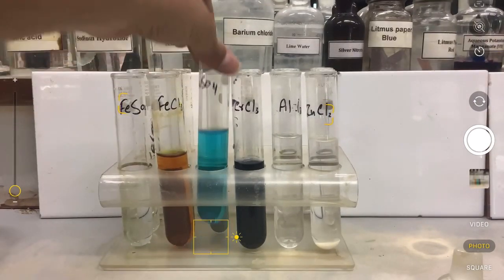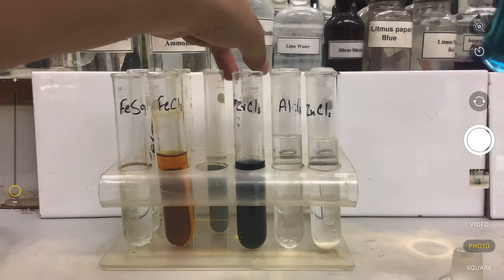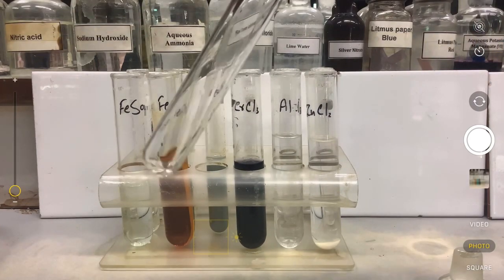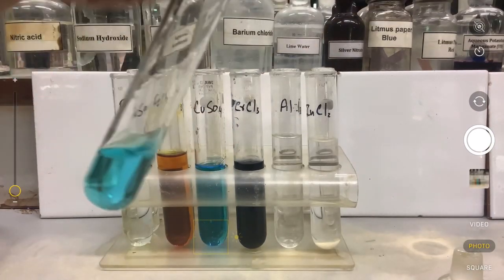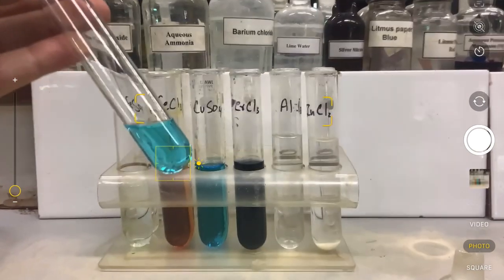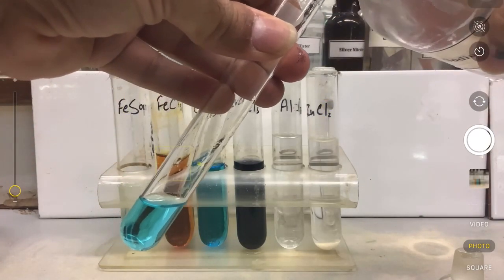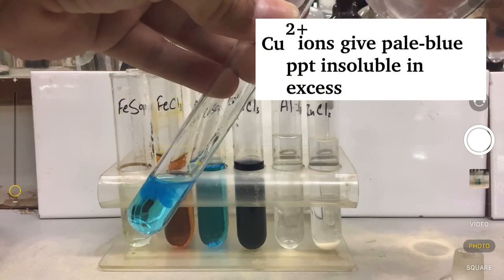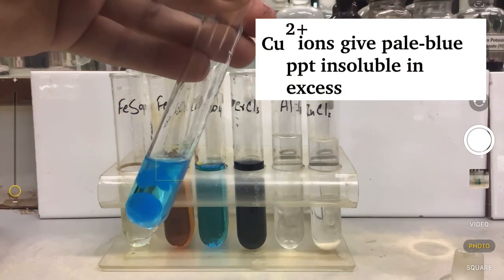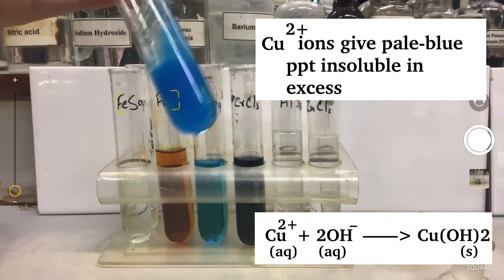Now let's move on to the most anticipated salt, which is very obvious that it's copper 2 solution. Copper 2 solution has this characteristic blue color, and you obviously know that this is a copper salt. When I add aqueous sodium hydroxide drop by drop until a change is seen, I will see pale blue or blue precipitates. But if you read, it clearly says insoluble in excess.